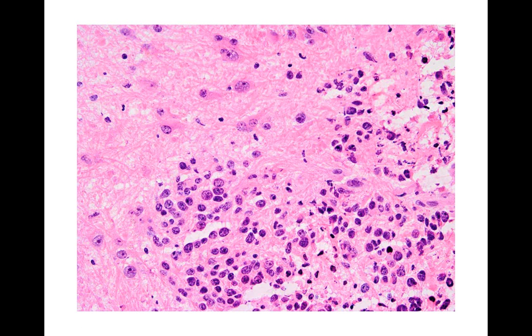So it takes a lot of practice, and even still, even after I've had a lot of training and several years of experience as an attending, it's still very scary when you start seeing cells like that, because even though they look cancerous, they're actually not.